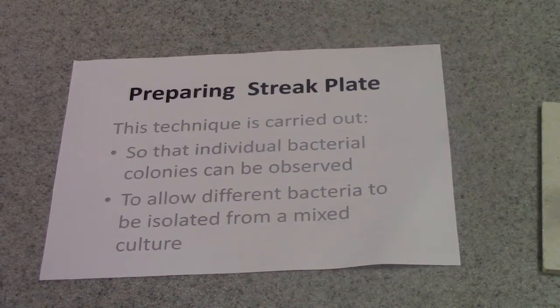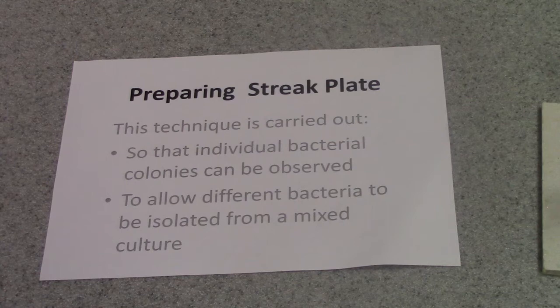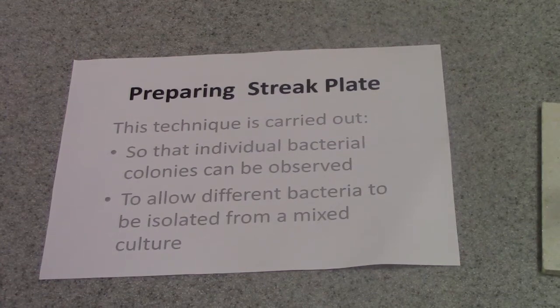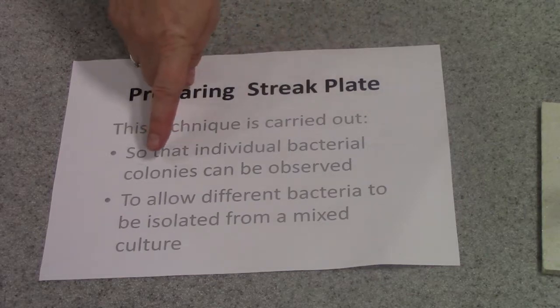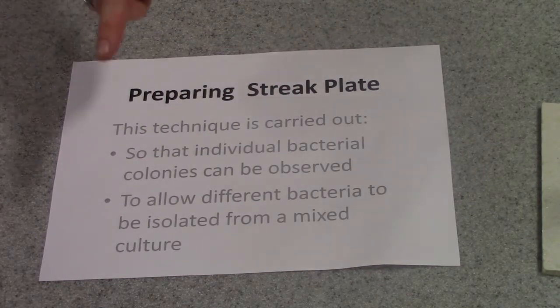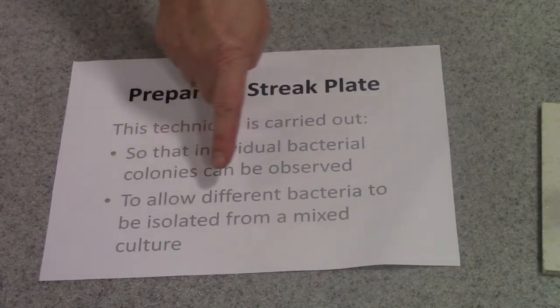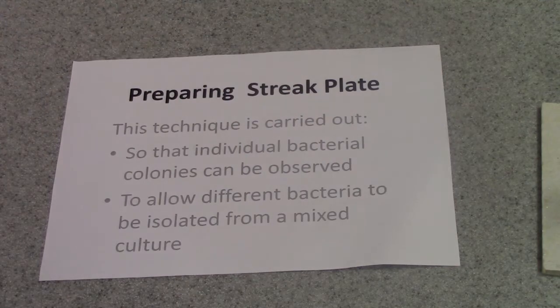I'm going to show you how to prepare a streak plate. This can be prepared for two reasons. First of all, it can allow you to see individual bacterial colonies. And the second reason is to allow different bacteria to be isolated from a mixed culture.